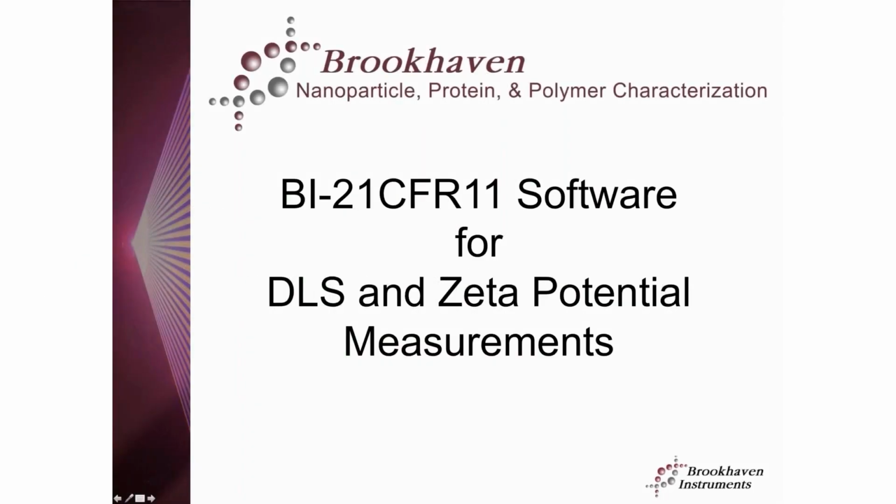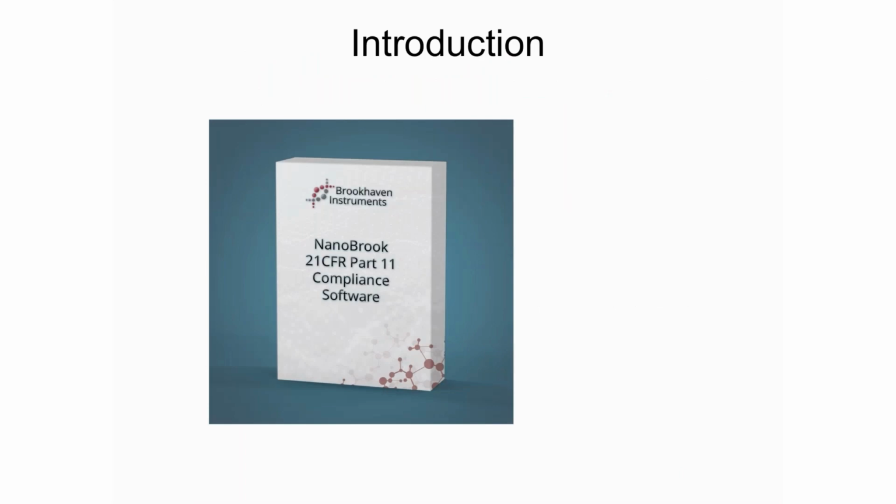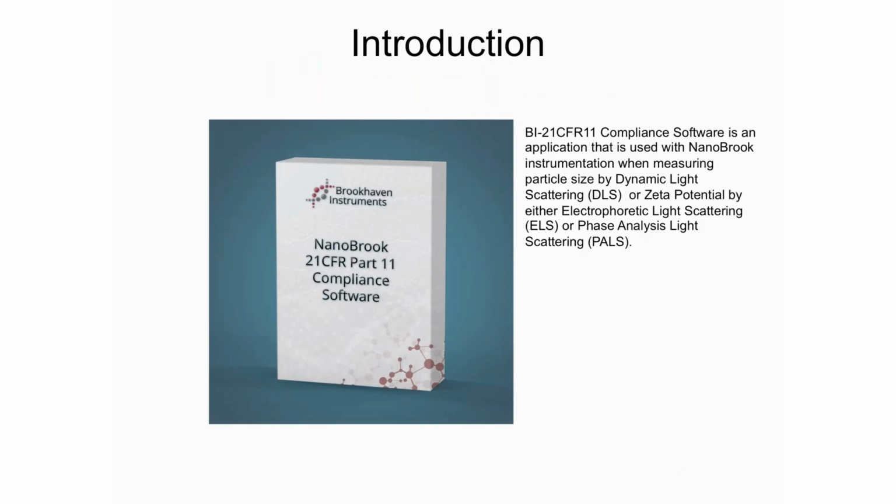Welcome to the Brookhaven Instruments video that's going to cover the BI 21 CFR Part 11 software used for DLS and zeta potential measurements. BI 21 CFR Part 11 compliance software is an application that is used with NanoBrook instrumentation when measuring particle size by dynamic light scattering or zeta potential by either electrophoretic light scattering or phase analysis light scattering. The measurements taken are part of an electronic record for 21 CFR Part 11 compliance.